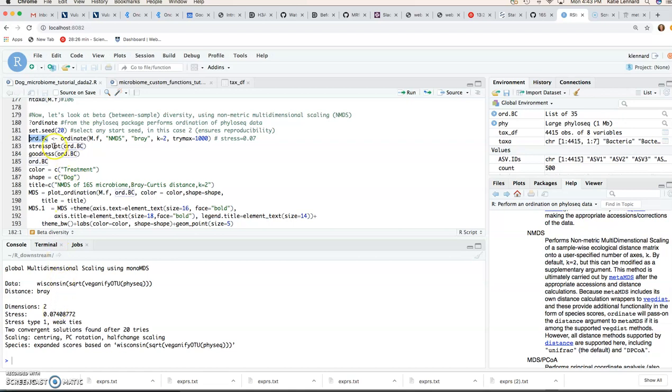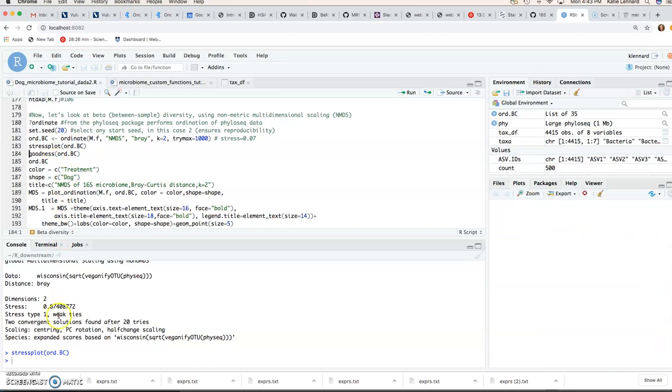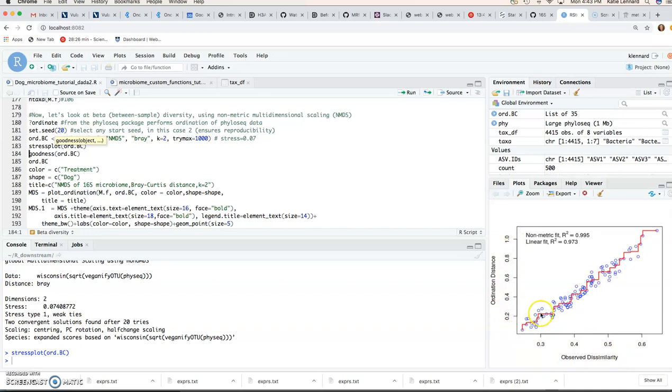And we can also look at the stress plots for that object. And that gives us a relationship between our observed similarity and our ordination distance. So what you're looking for here is kind of a linear relationship like this with a good linear fit value.